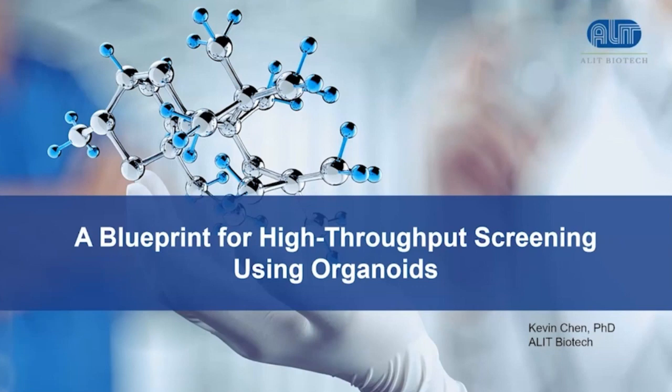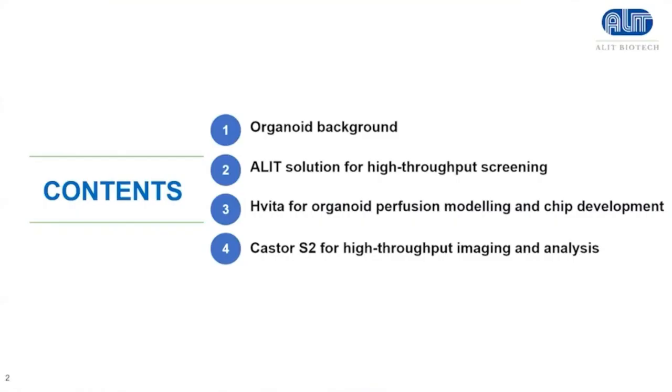My topic is a blueprint for high-throughput screening using organoids. I'm Chen from ALIT Biotech company. And today I'll share four main parts with you.